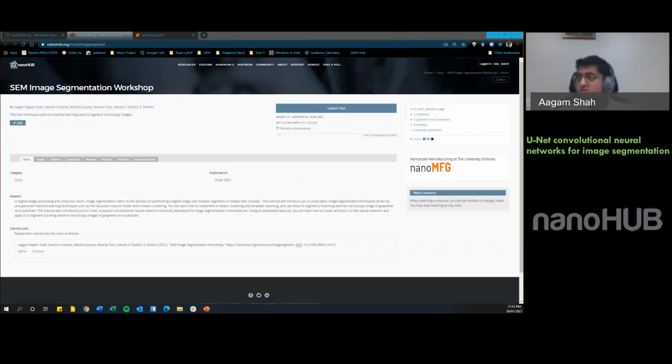So this particular code that we will be using today isn't going to be open source, but it will be in about a week.